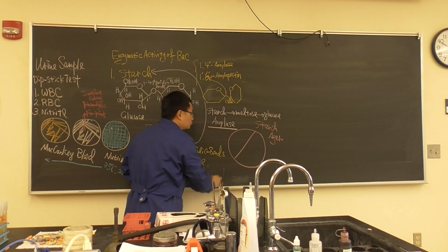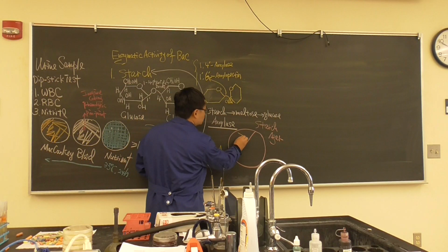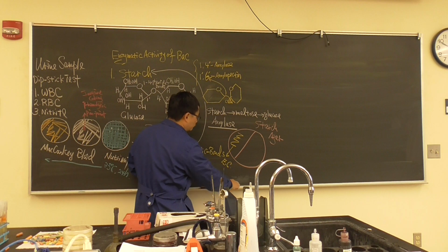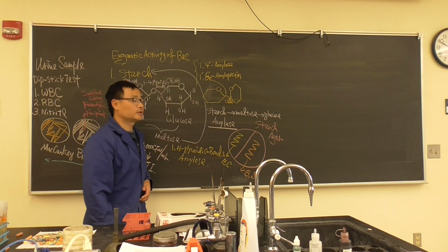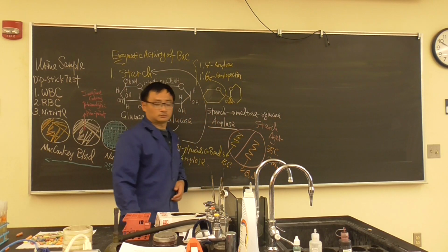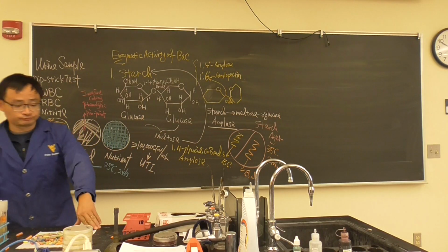And we split them into two. The left side, we will inoculate E. coli. And the right side, we will inoculate Bacillus subtilis. And after 35 degrees Celsius, 24 hours, how do you know starch is gone, or starch is still there?